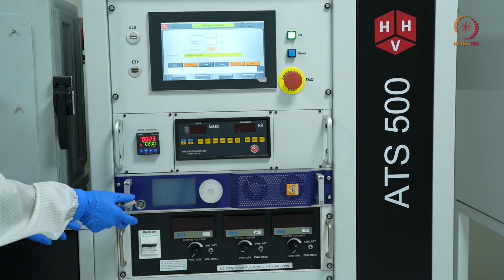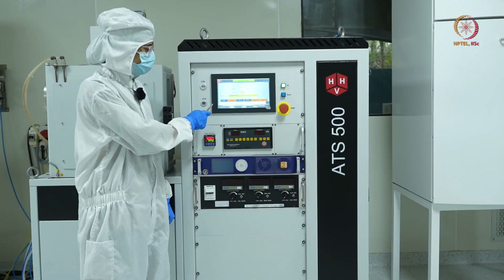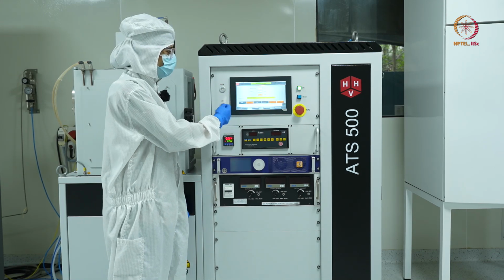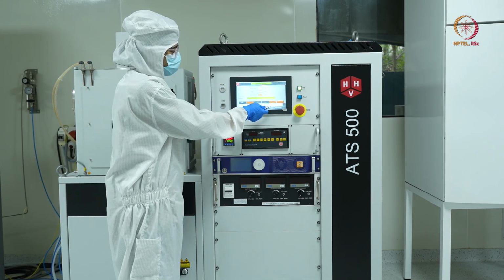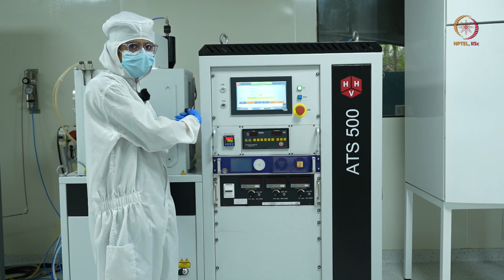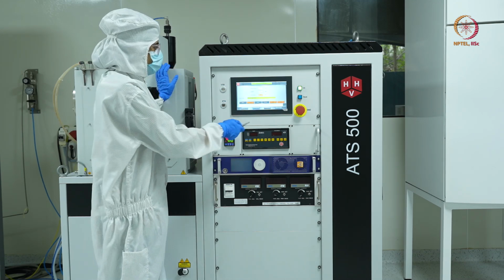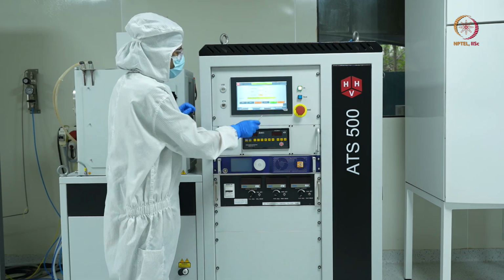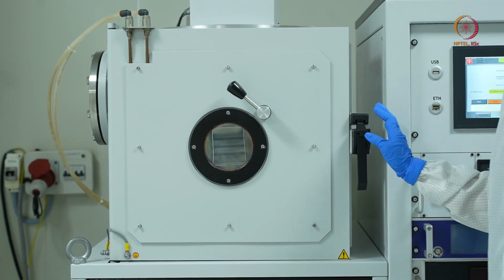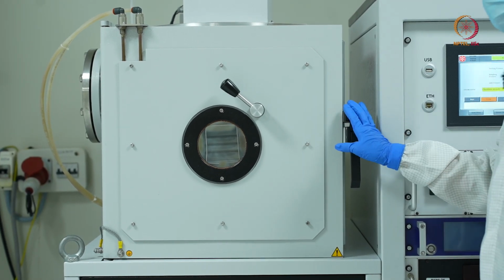Now you can see on the prompt that turbo is ready, and that means that the turbo has reached its maximum speed, and now we can vent the chamber. We'll vent the chamber because we need to place our sample for the deposition. Currently the chamber is in some vacuum, so I'll press vent and wait for a couple of minutes for the chamber to vent. The chamber has vented, and it is safe to open the chamber.